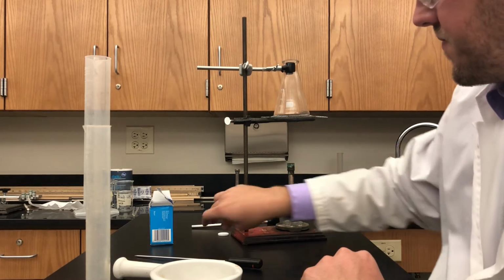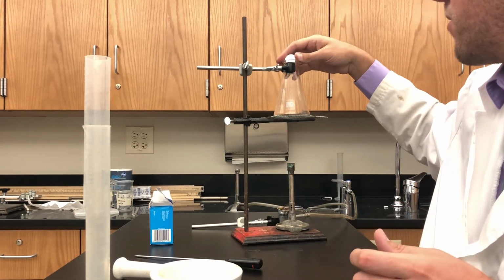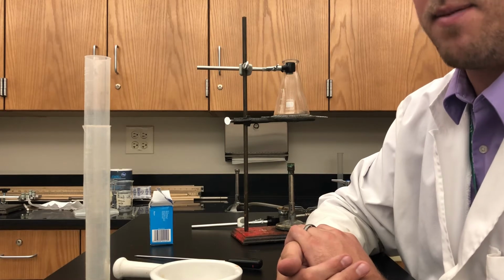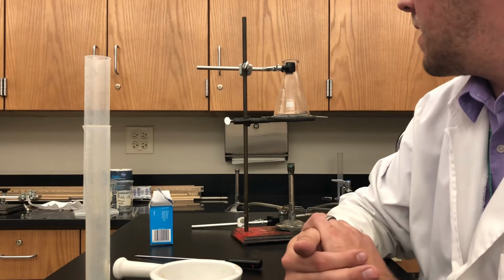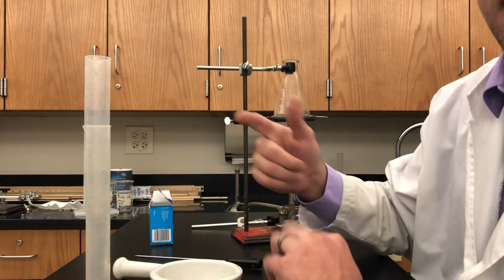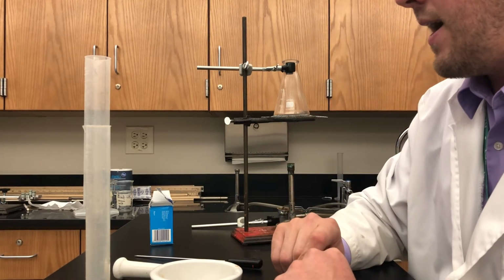So you get to whatever temperature it is that you want to get to, you turn your gas off, and then you grab your Alka-Seltzer tablet. Use a timer, use those little red timers you've got, drop your tablet in there, and then wait till it's done reacting. I'm going to let you decide when it's done reacting. Is it when you can't see any bubbles anymore? Is it when all the white powder is gone? I'll kind of let you make that call. But you're going to time that. And then you're going to do the whole thing again, but you're going to go to a different temperature, either warmer or cooler, and you're going to try a set of different temperatures and see how that affects how long it takes that Alka-Seltzer reaction to occur.